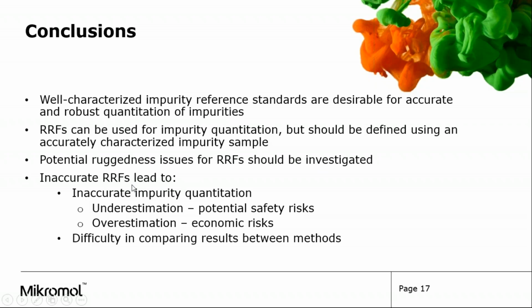And that if anything, we want to err on the side of having an overestimation, but realizing that this is going to incur potential economic risks, but wanting to avoid the safety risks of underestimating impurities. And that inaccurate RRFs can cause difficulty in comparison of results between methods.